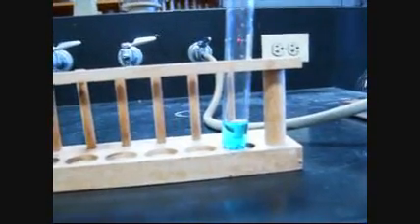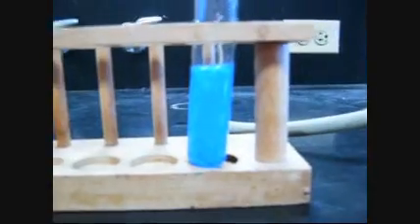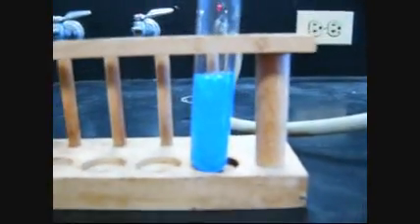Alright, and then for the first reaction we're going to add to the copper sulfate 7.5 milliliters of sodium hydroxide. So I'm just going to pour that in there. And we notice a change. We notice that there is a kind of gelatinous precipitate.